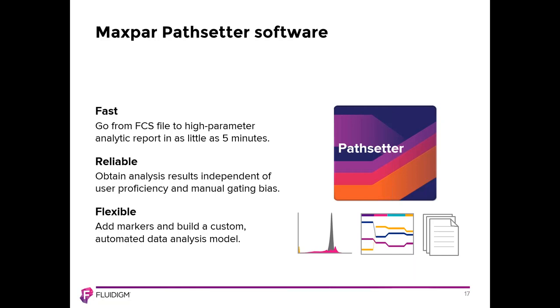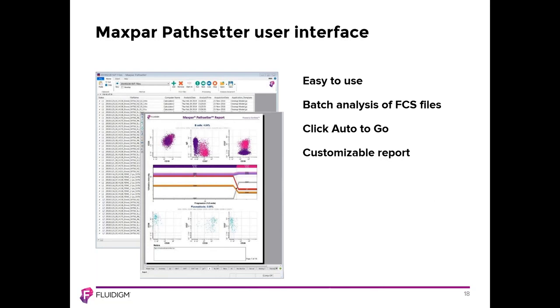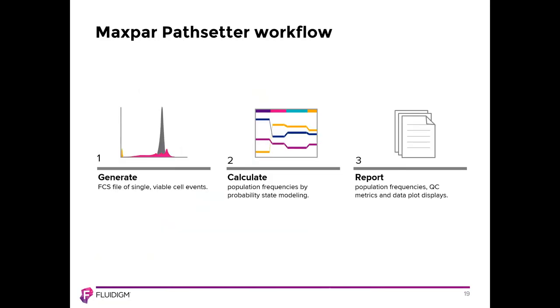Pathsetter provides analysis results independent of user proficiency and manual gating bias. It is also flexible, allowing you to build a custom automated data analysis model if you want to add antibodies to the Maxpar Direct Immune Profiling Assay. Maxpar Pathsetter provides an easy-to-use interface where multiple FCS files can be loaded and analyzed as a batch. Simply click Auto to have Pathsetter automatically run data cleanup and analyze your files — a few minutes later, the report will be ready to explore and export. In Step 1, Pathsetter generates an FCS file of single viable cell events. In Step 2, population frequencies are calculated by probability state modeling. In Step 3, the report is generated, including population frequencies and QC metrics.